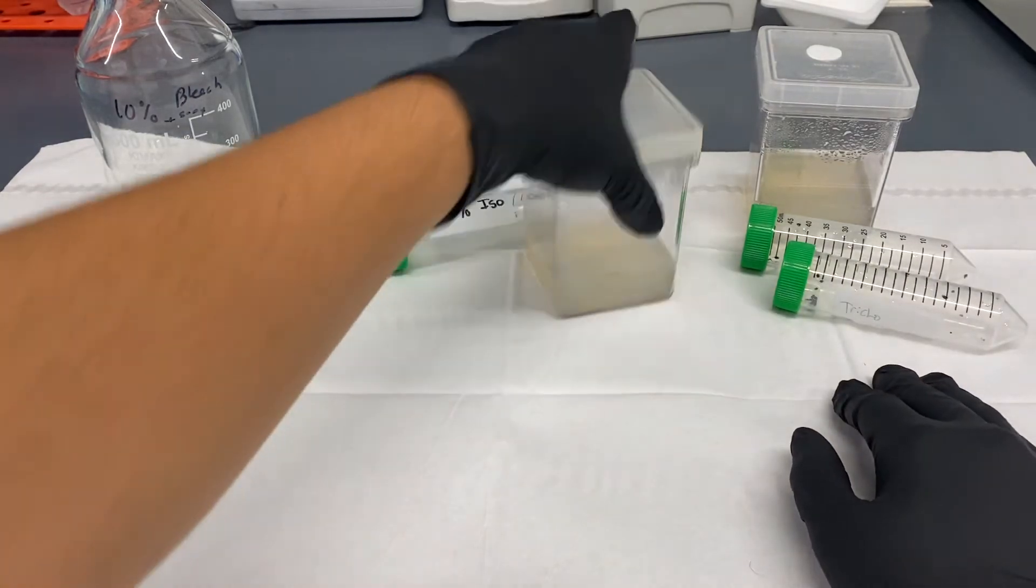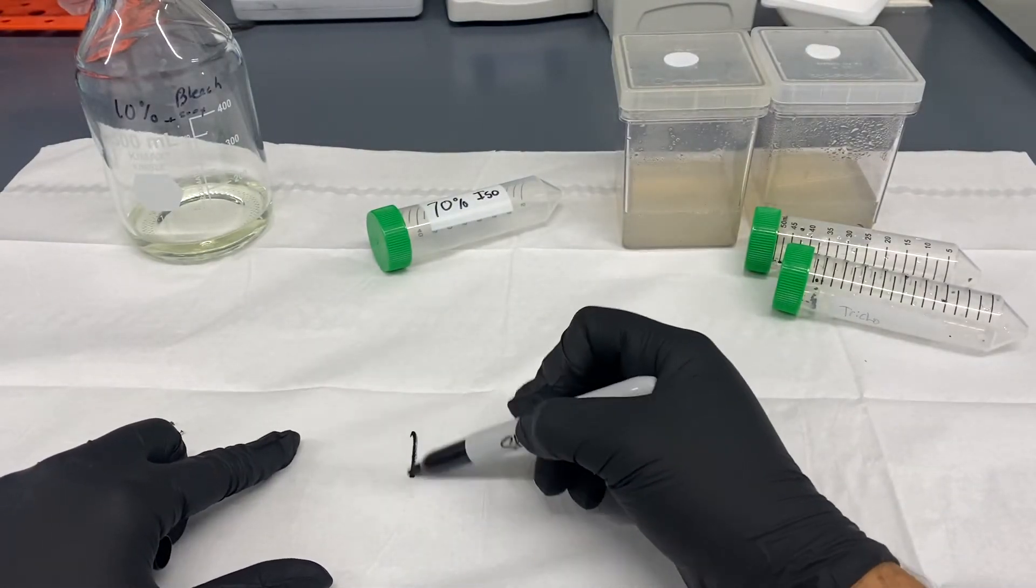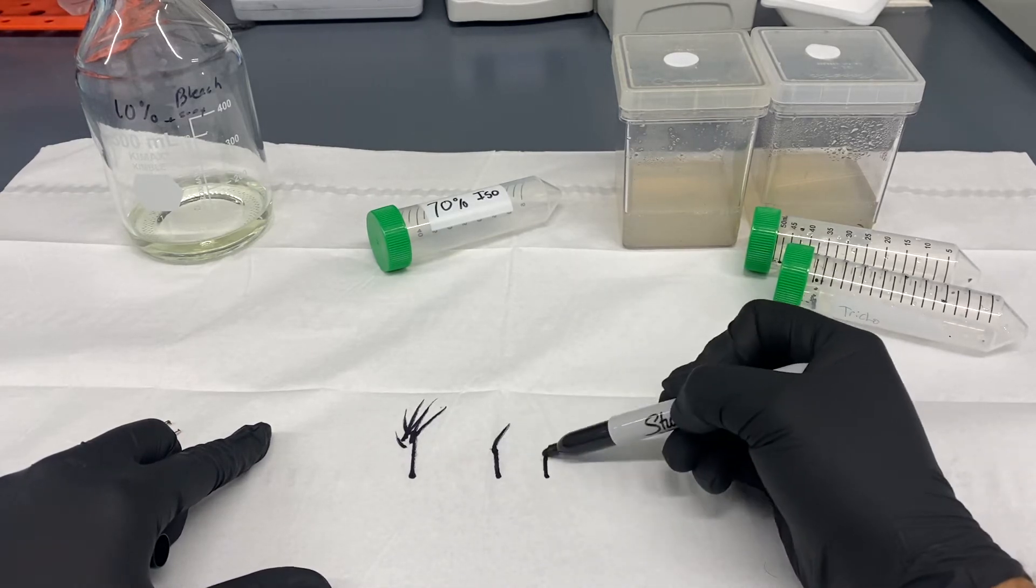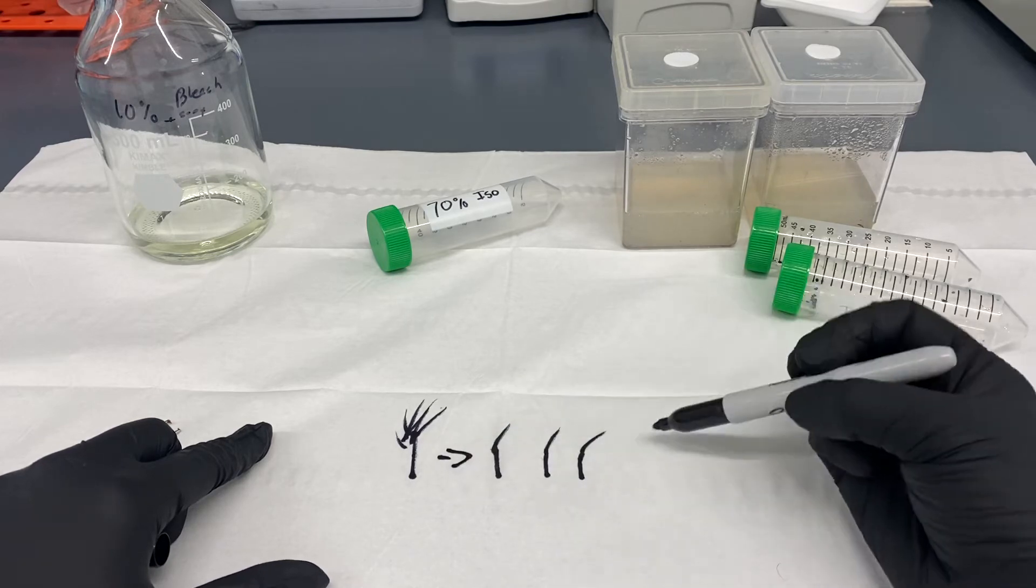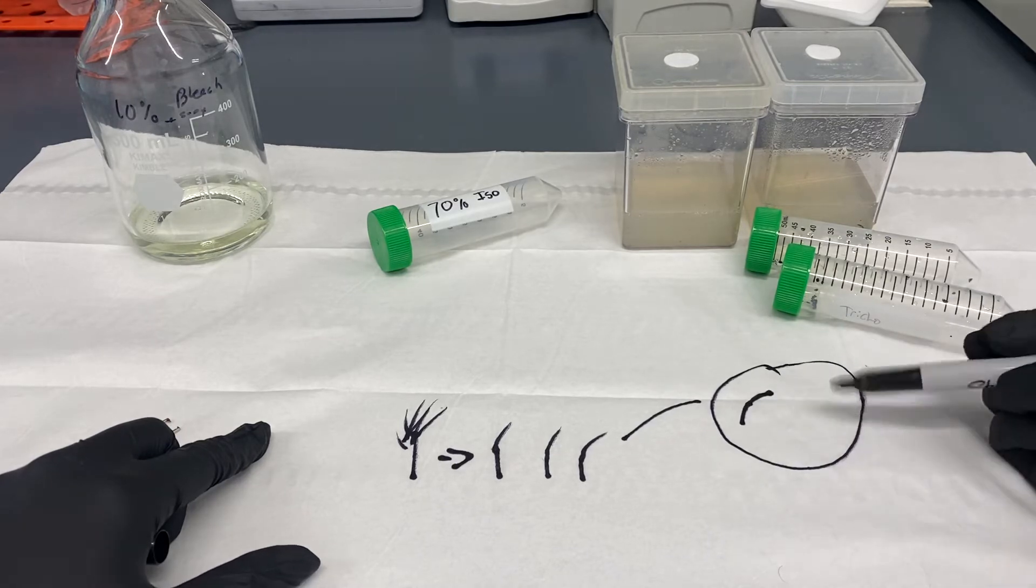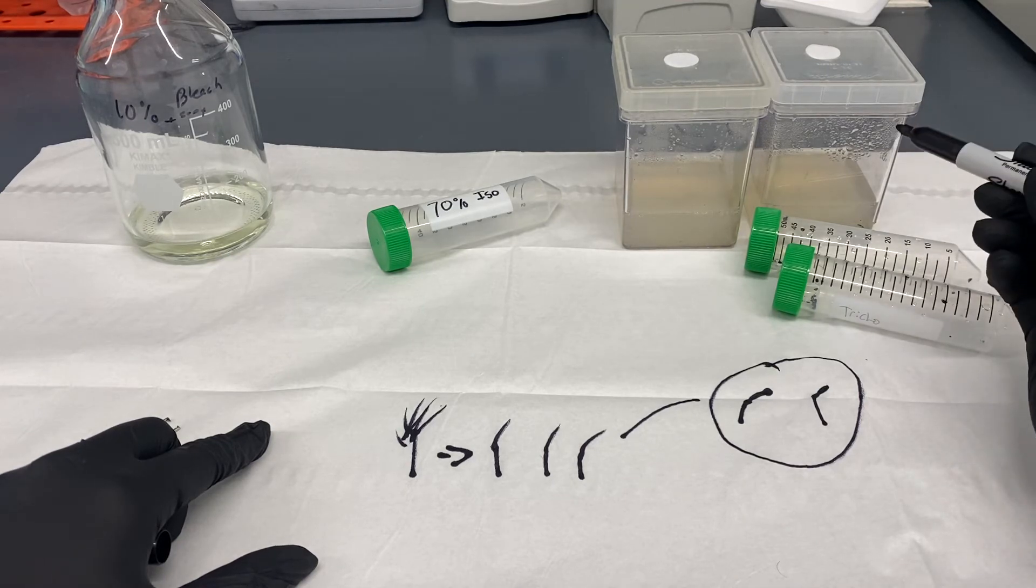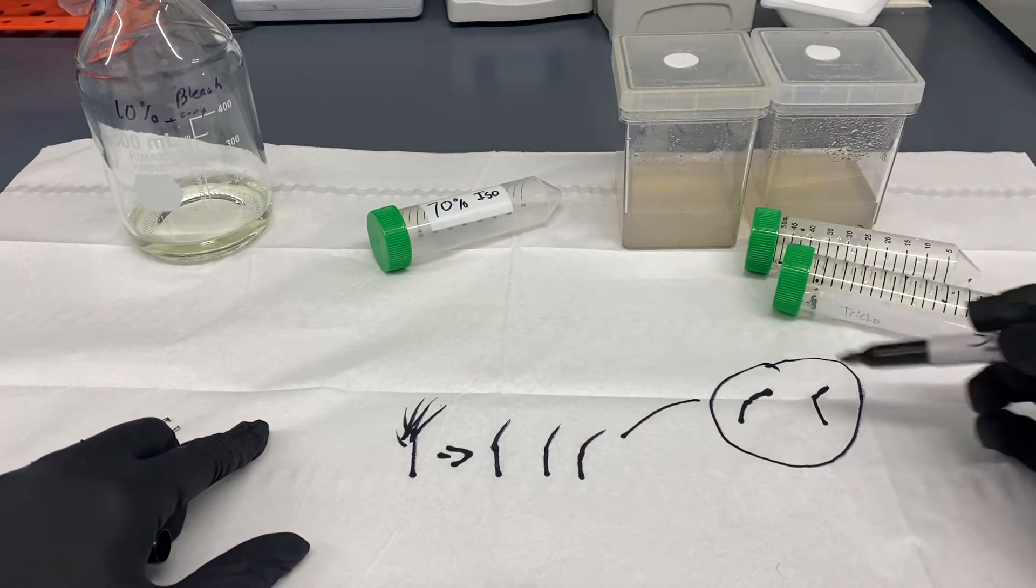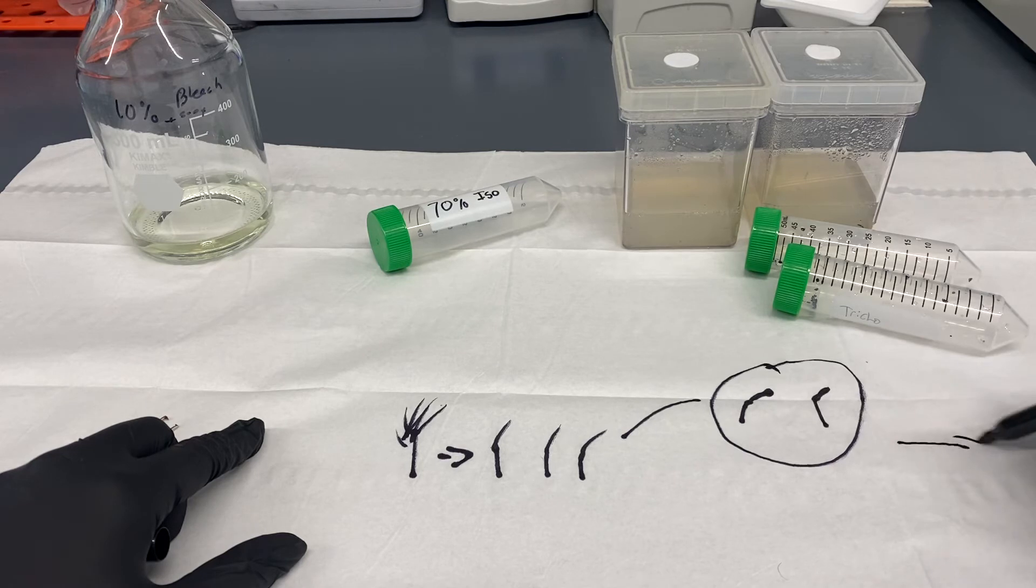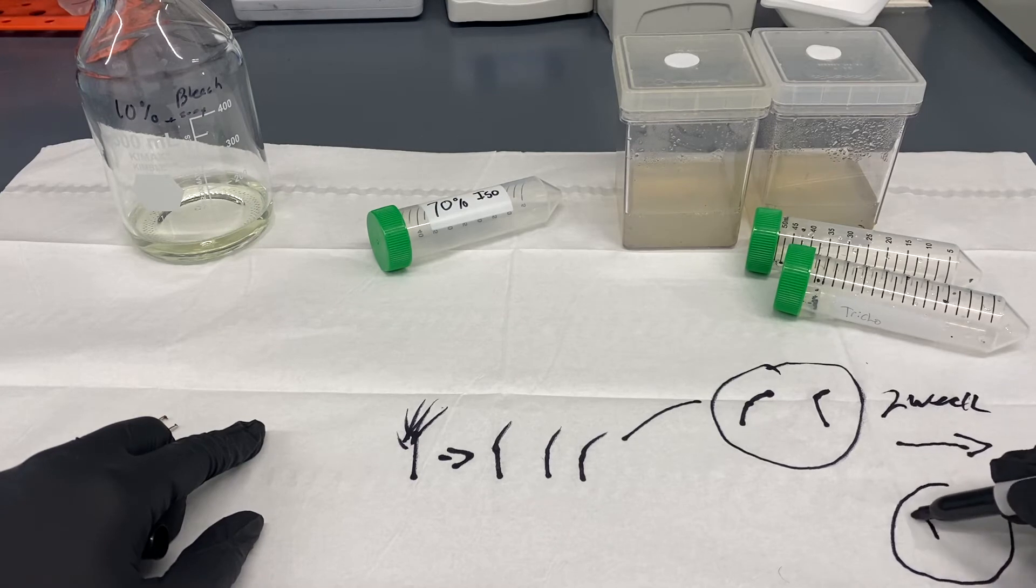But yeah, general overview: pretty much you have your plant, then I'm gonna cut it up so that I have multiple. And then I'm gonna put those on either a petri dish full of media or these are called magenta boxes, GA-7 vessel, or a GA-4 if you want a shorter one. You can use petri dishes as well and you go ahead and place it on that media.